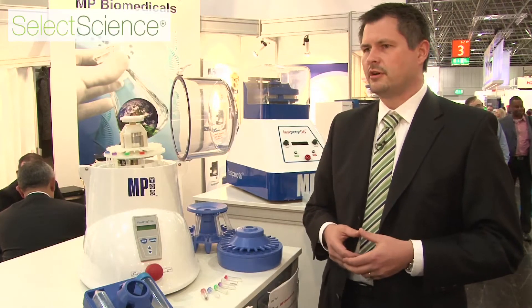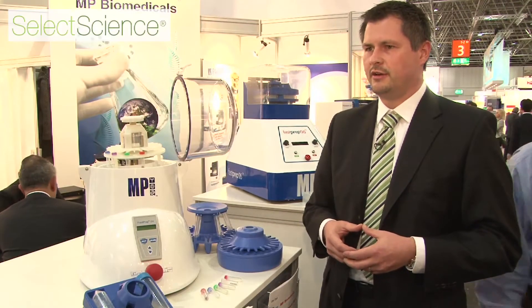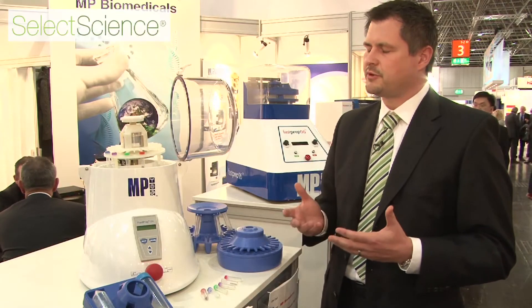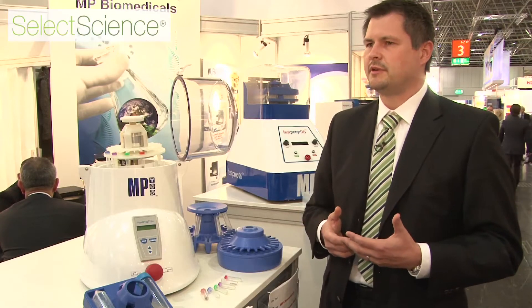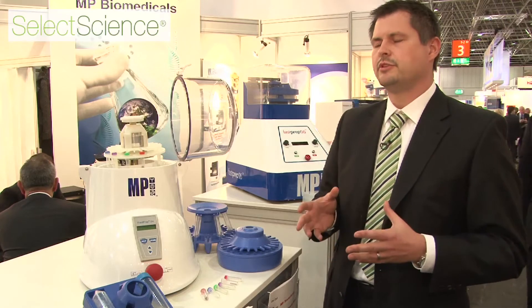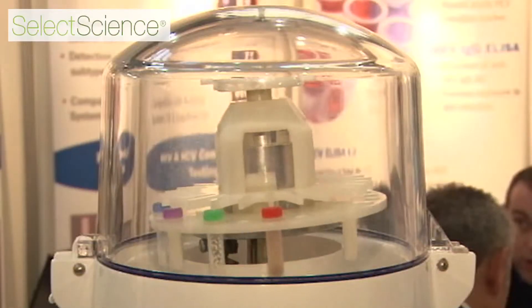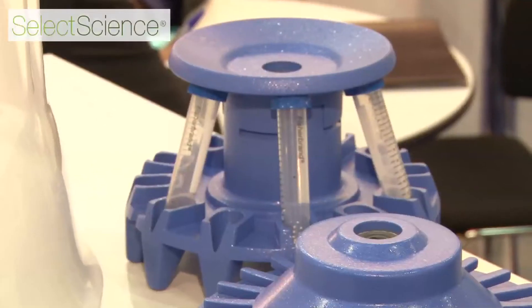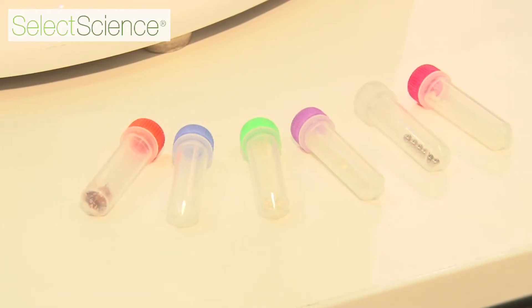But today I'm here to talk about sample preparation. Homogenization is a really important step for labs, and therefore we have developed a family of instruments — the FastPrep family — that can help you homogenize all of your samples, whatever they consist of, and you can do it with the machine. It basically shakes, and we have a lot of different interchangeable adapters that can help you do this job.